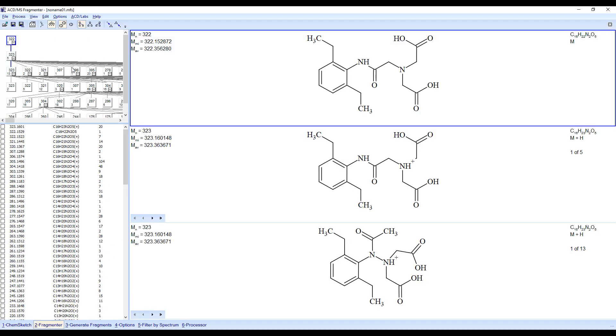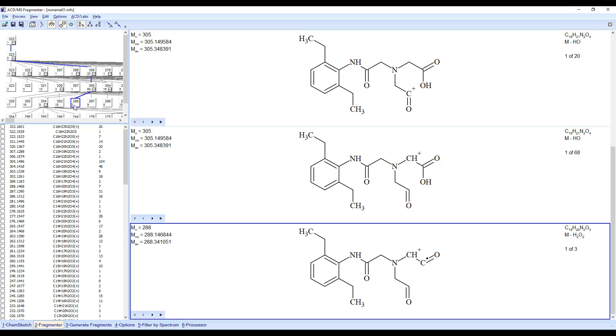This is the map that highlights the fragmentation branch, and below are all of the possible fragments with their molecular formula and monoisotopic mass.